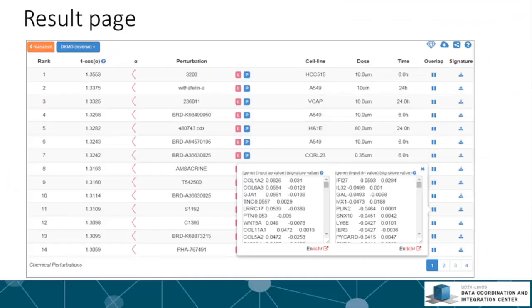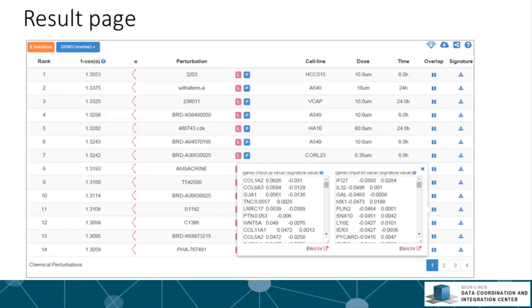On the results page, the search results are rendered as a paginated table with 14 entries per page. Each entry provides seven pieces of information about the signature: rank, score, perturbation, cell line, dose, time point, and overlap with the input.